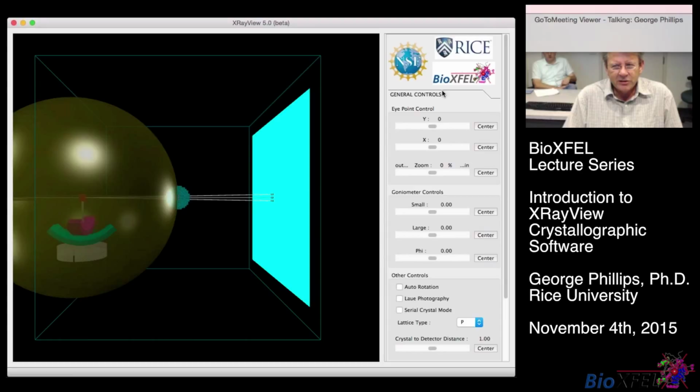I hope you'll appreciate seeing the teaching software that I've been developing over the years, and there have been some recent additions for teaching serial femtosecond crystallography that Mike Daly, who's sitting back there, has recently implemented as a part of the BioXFEL contribution to the program. So if you're learning, I hope it'll be helpful, or if you're teaching, I hope learning about the tool will be helpful in your teaching efforts.